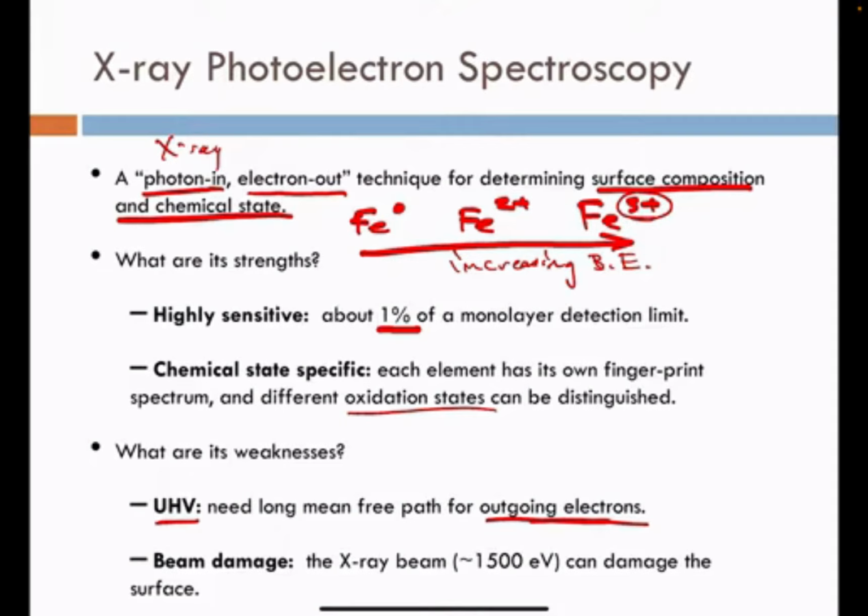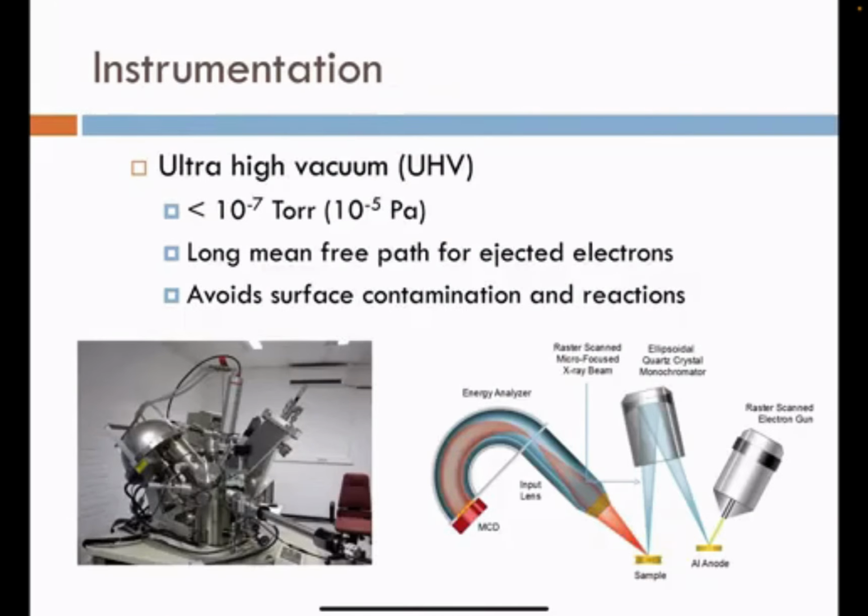Since we are using X-ray excitation to emit the electrons from within the atoms, we can expect some damage to the surface, and often we have to measure certain materials very carefully. Copper, for example, is known to change as you interrogate it with XPS. So if you have a certain oxidation state in your copper metal, that might change as you apply X-rays to obtain the XPS spectrum. So you have to be very careful in analyzing copper.